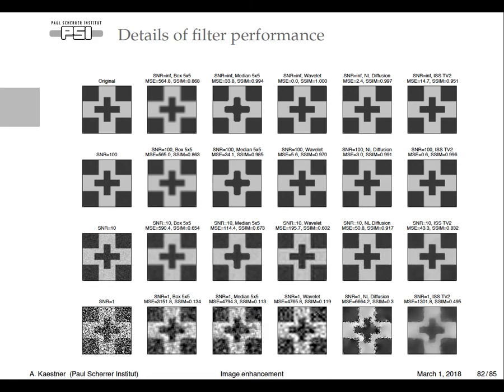And you can really see the effect that the edges are noisy, but the rest is pretty well smoothed. And then the last one, the ISS filter, is the one that has the strongest filter effect and still maintains the structures relatively well compared to the other ones under the same condition.